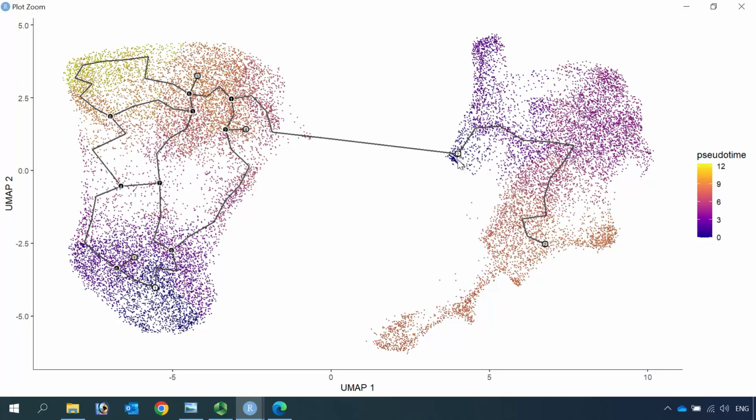So the progenitor cells generate the alveolar fibroblasts, then they became myofibroblasts in fibrotic lung. And for the smooth muscle cells and the pericyte clusters, you can see the cells start from here, and all the fibrotic pericytes could be derived from the progenitors of smooth muscle cells.